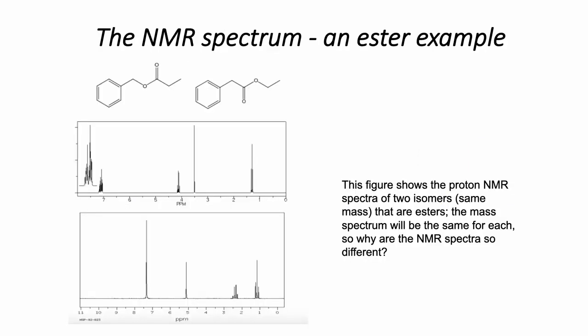And so here's an example of an ester. I think that you all are going to be synthesizing esters. So if we look at these 2 compounds, and something I didn't point out, well, I'll show you this in another slide. Anything that appears in an aromatic ring is going to be de-shielded, so it's going to be far downfield. And I think I said that before. You've got the electron density of the pi orbitals above and below the ring, which would shield something, but those protons are held not there, but straight out from the ring.